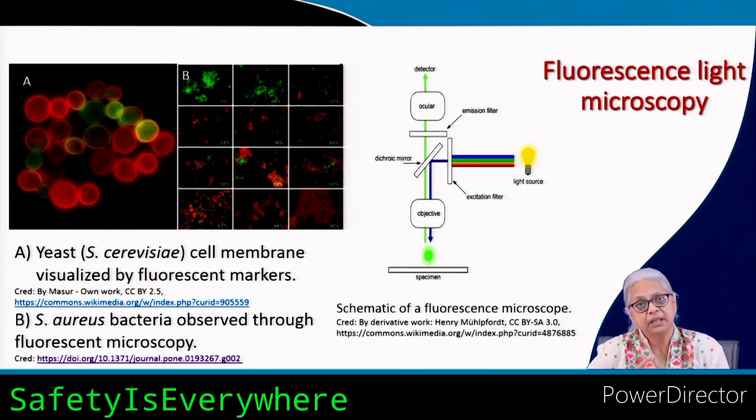Now if the cell membrane is intact, it means the cell is likely to be alive and viable and capable of reproducing. On the other hand, if the cell membrane has been damaged, then the reaction to the fluorescent dye is going to be different. The color that is caught, in this case, is red. In the case of the living cells or intact cell membranes, the color is green, and that is because of different dyes reacting in a different manner.